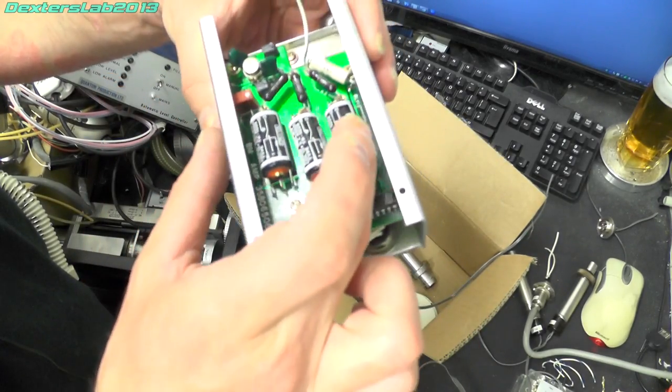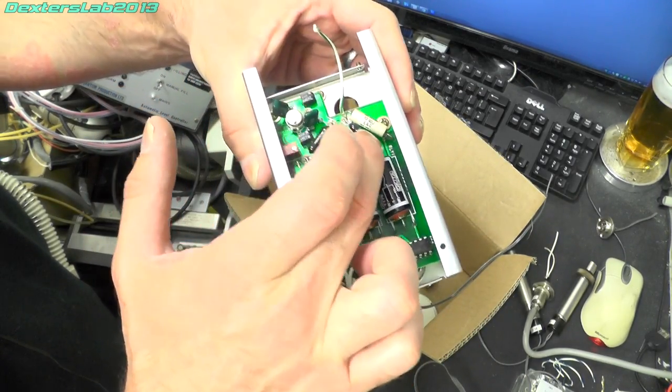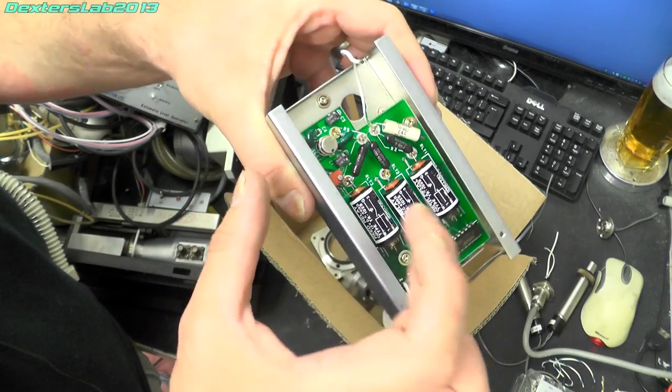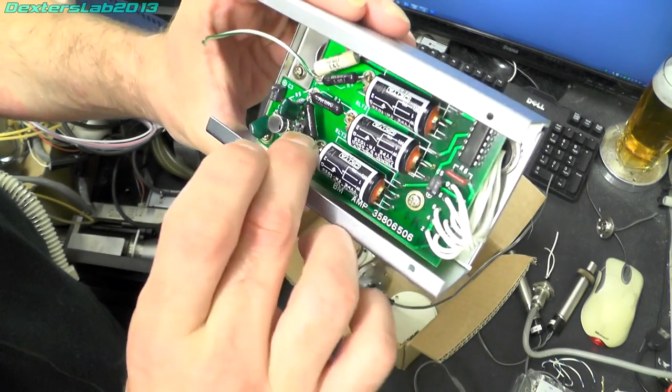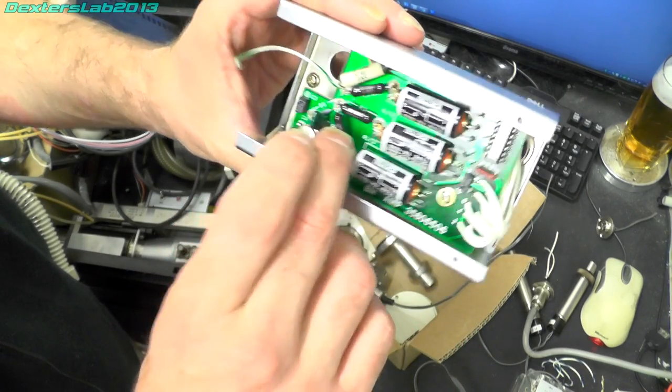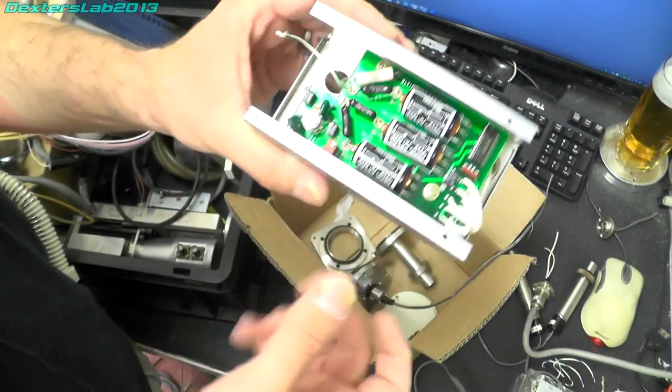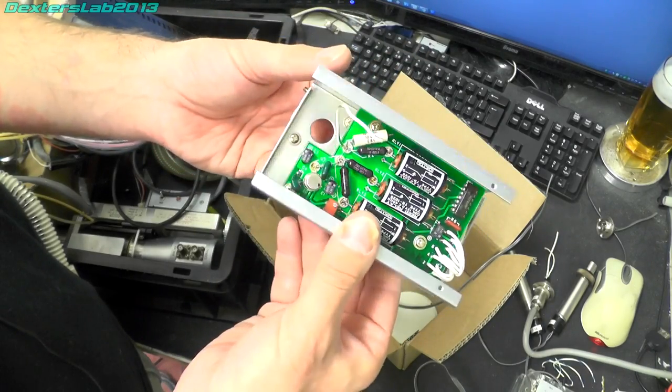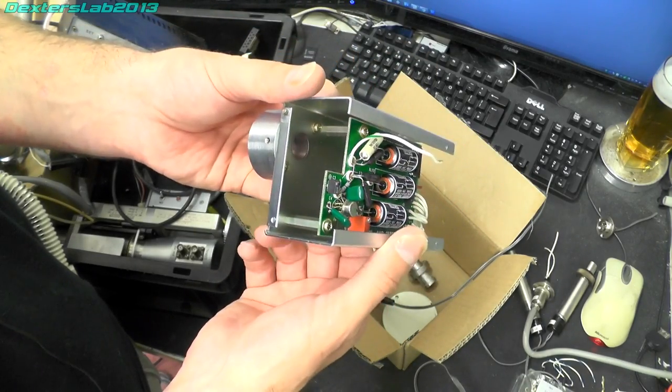We have 10 gigohms, we then have 1 gigohm, 100 meg and then we've got 10 meg. So yeah I think this is just a really basic attenuator.